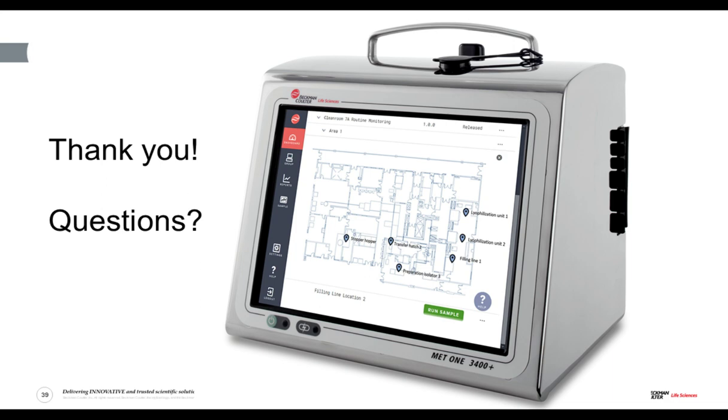Thank you very much for your question. It's a good question. So no, the counter is not connected to the internet. What actually happens is the counter has its own web server inside the Clarity software. So what you do is you use your web browser to connect across your company internal network to the counter. You simply enter the IP address that your network assigns to the counter when it connects to your network into your own web browser navigation bar. And the IP address can be found on the front screen of the counter itself.